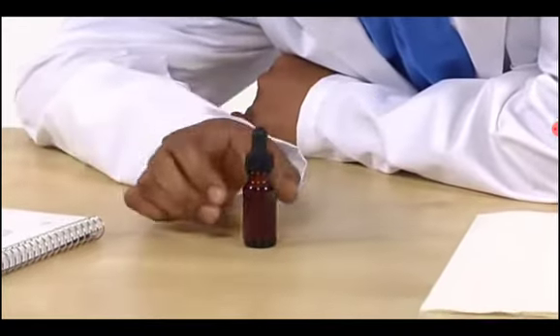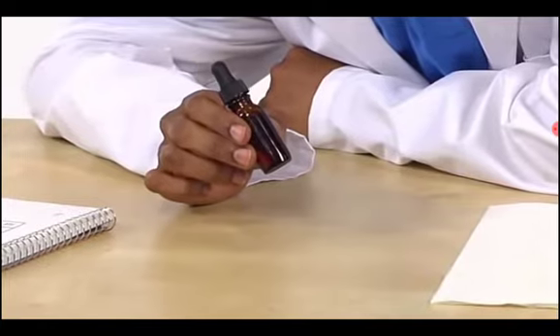Iodine is a reddish-brown liquid that turns blue or black on a starch. Be careful with the iodine. It can stain your clothing. After all my observations, I'll record the findings in my data table. All right, here we go.